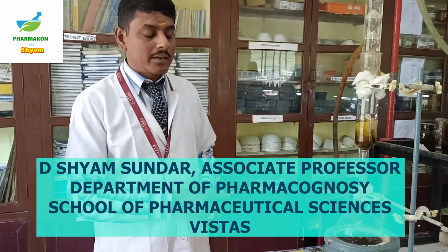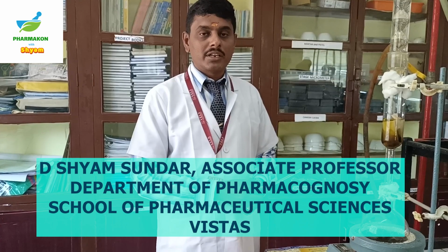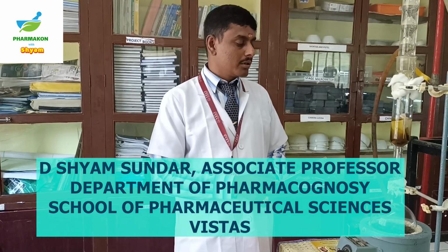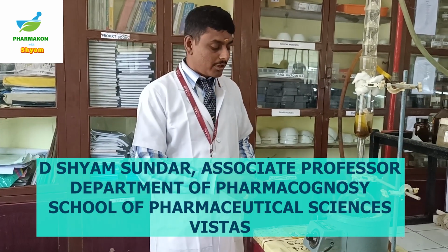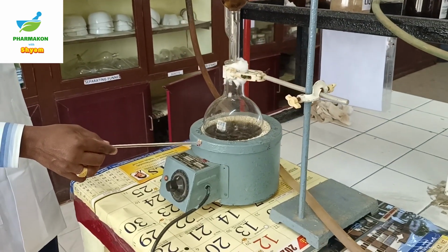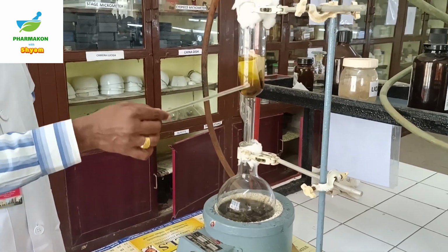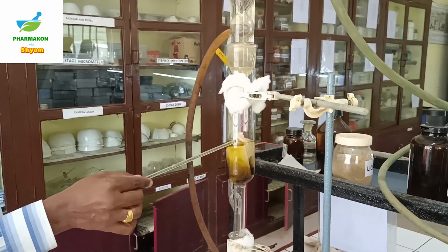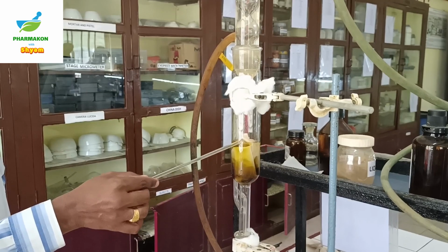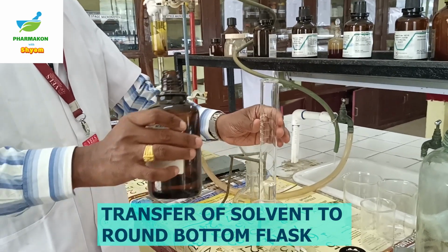The Soxhlet apparatus was discovered by a German scientist by the name Franz von Soxhlet. It consists of four parts. Number one, the heating mantle. Number two, the round bottom flask. Number three, the Soxhlet extractor. Number four, the condenser.